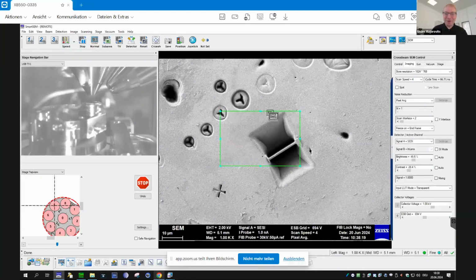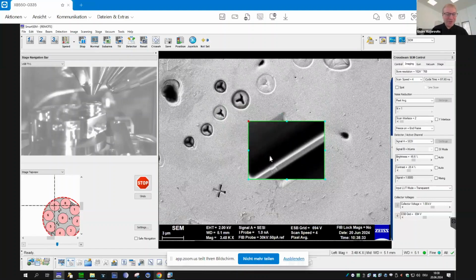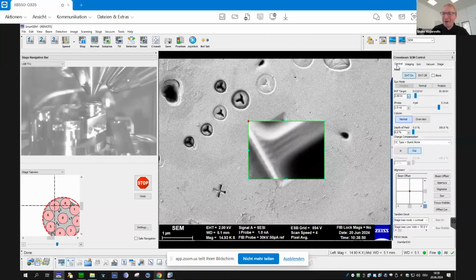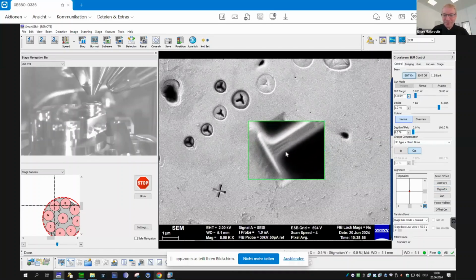Okay, of course, we have something like reduced area imaging. We can go to reduced area and zoom in and out. So now I'm going to press F5, the function key, which is linked to magnification. I can hit Control Tab and bring a certain feature into the center, hit F6 to switch the mouse wheel to focusing and so on. Then if I'm not happy, F5 again for zooming in, I might have to improve on stigmation, for instance. Quite a bit, stigmation, okay, focusing a bit better, and so on. So it's quite handy to work with all these tools.